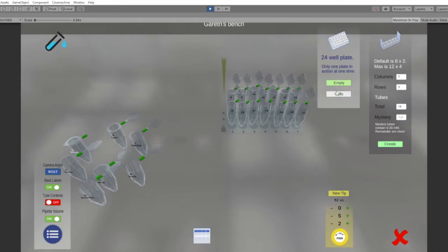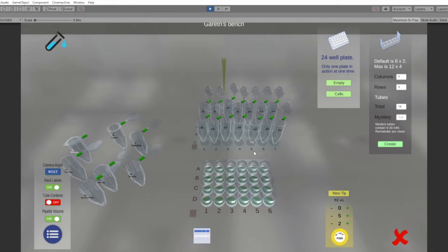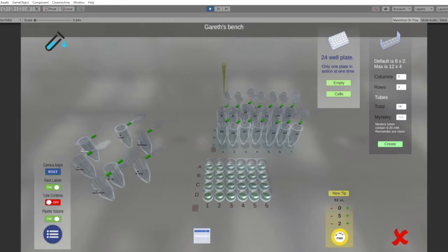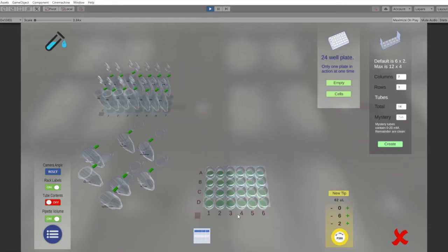Now, we're going to make a plate of cells, so let's bring that plate of cells to the fore, and we're going to pipette the contents of each of those tubes into a well. Now, this, of course, is where I've set things up badly, because I've got wells which are 7 wide on the rack, and yet the plate is a 6 well by 4 well plate, so I'm bound to get confused at some stage. It's okay for the first sort of 6, and then suddenly you'll see me thinking, am I putting the right thing in the right place? Around about here, I think, is where I think, have I already just pipetted something in that one or not? Anyway, so the different mixtures are going in there.